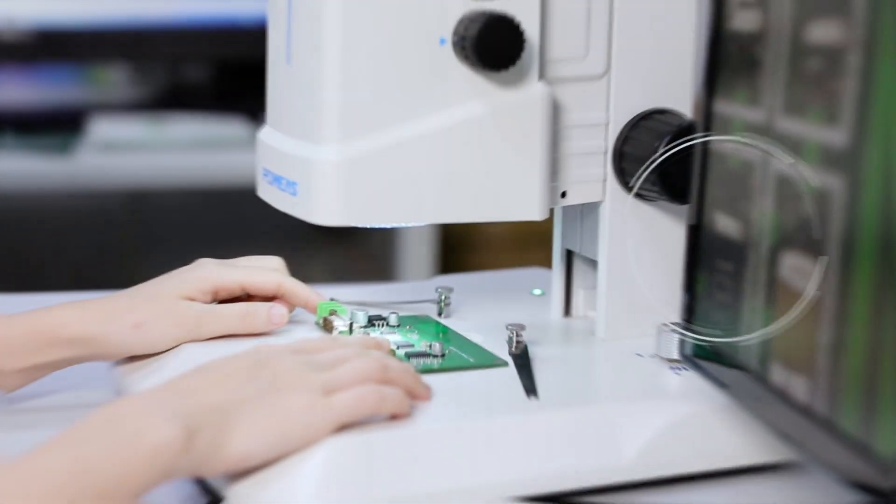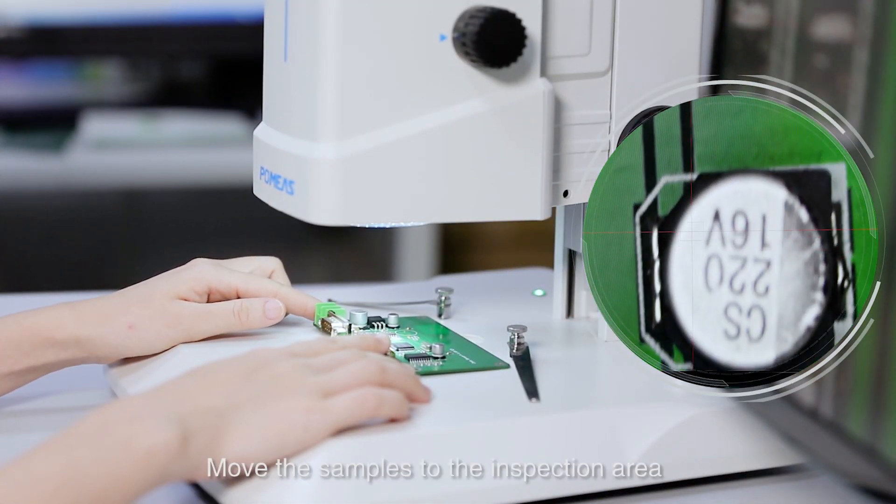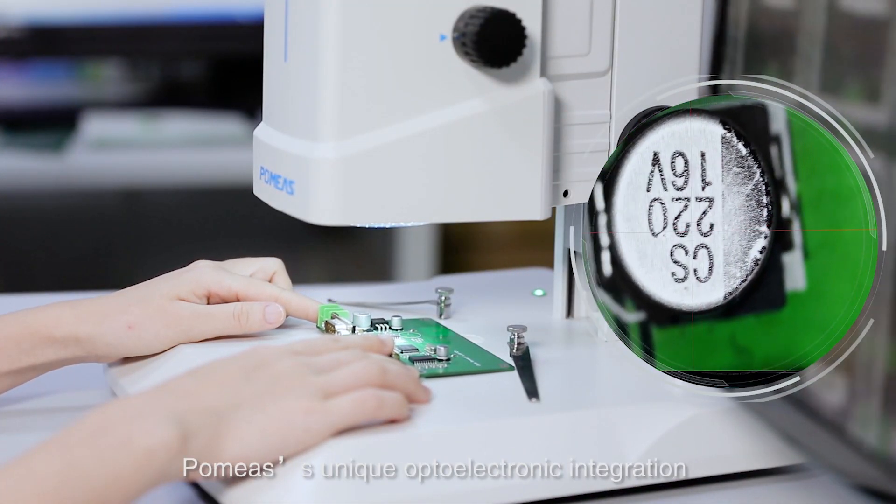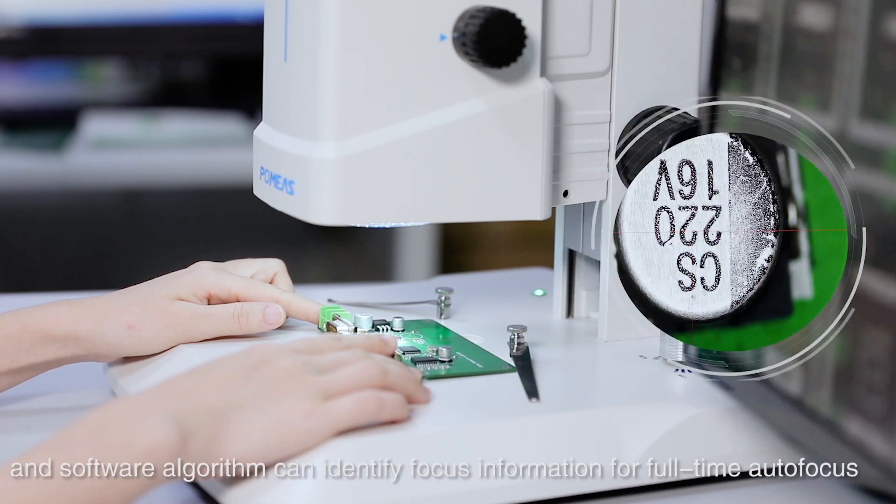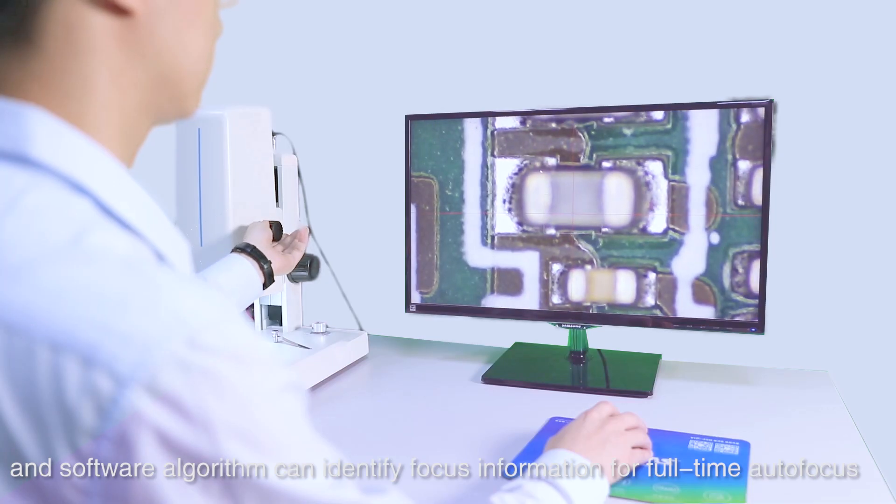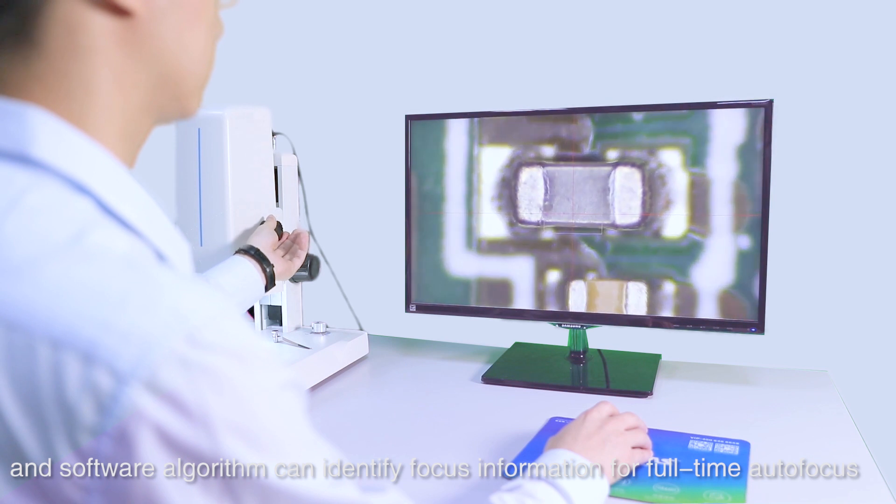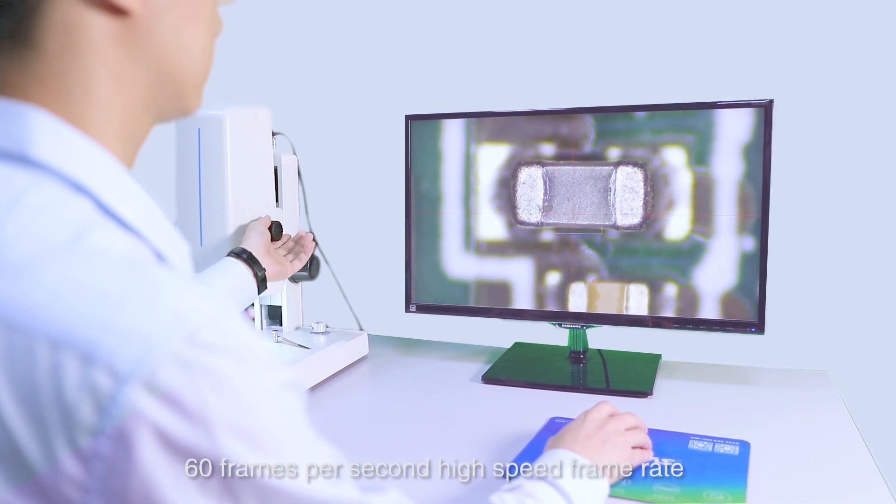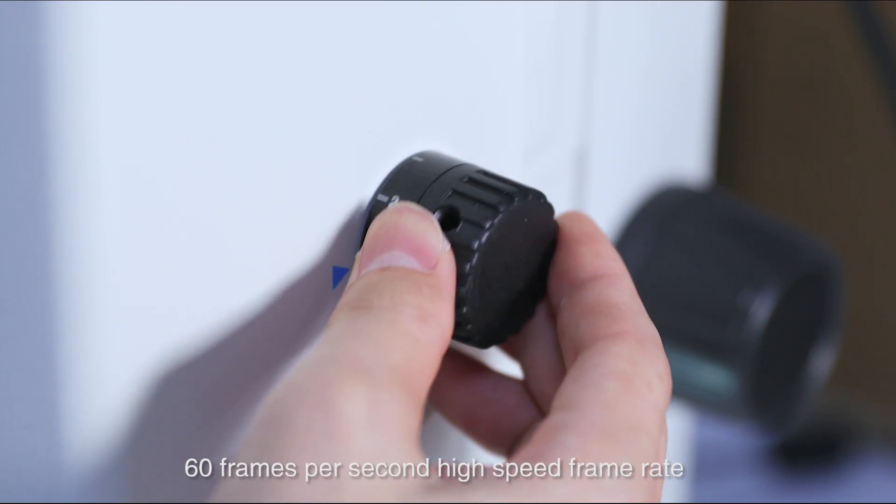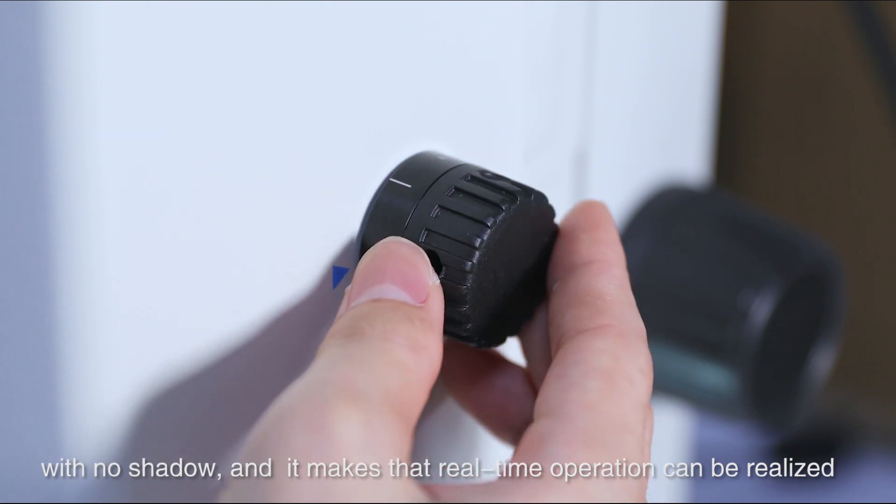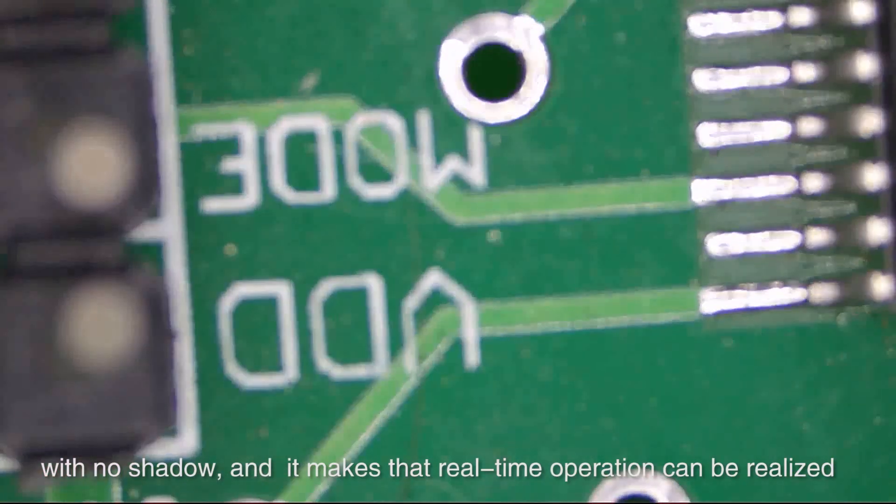Move the samples to the inspection area. Pomius unique optoelectronic integration and software algorithm can identify focus information for full-time autofocus and also use 60 frames per second high-speed frame rate with no shadow, so real-time operation can be realized.